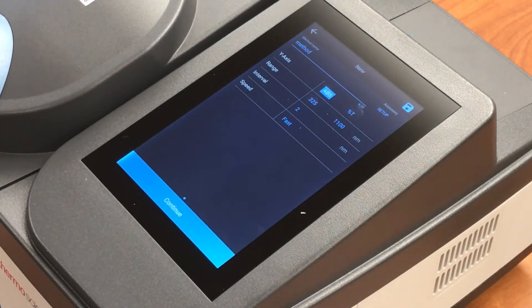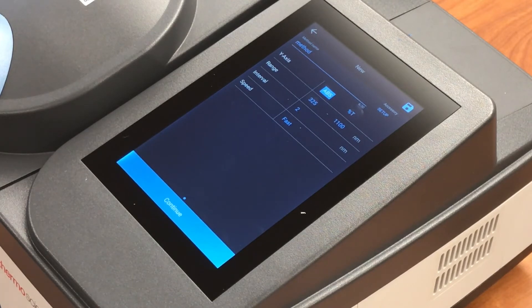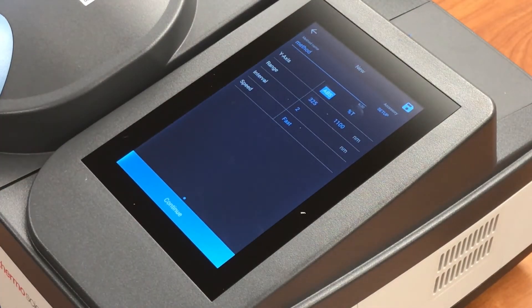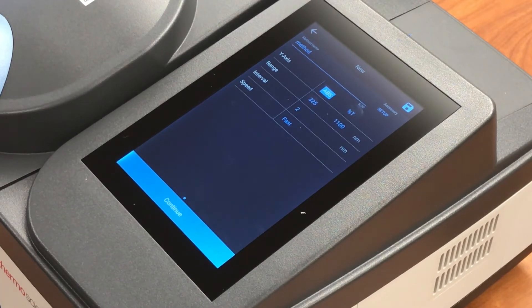To change the wavelength range, you simply touch the wavelength that you want to change, and then input the wavelength that you're interested in. The interval is the wavelength spacing at which the data will be collected.